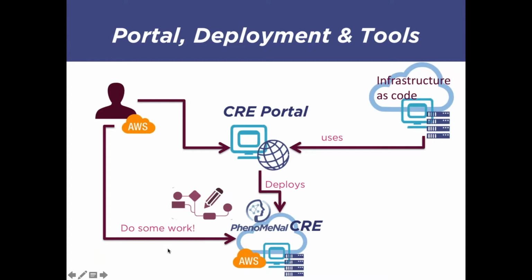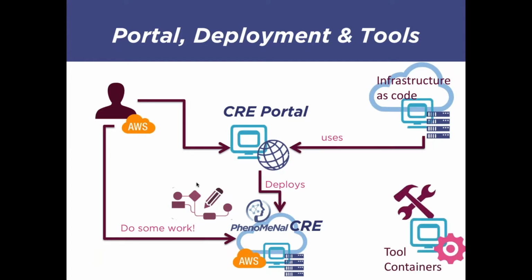And for that to happen, and because we don't want the user to have to deal with command line interfaces or having to do any programming on the tools or any scripting, we provide workflow environments with user interfaces that the user can use to actually execute the different tools and workflows that you require to do metabolomics data analysis.